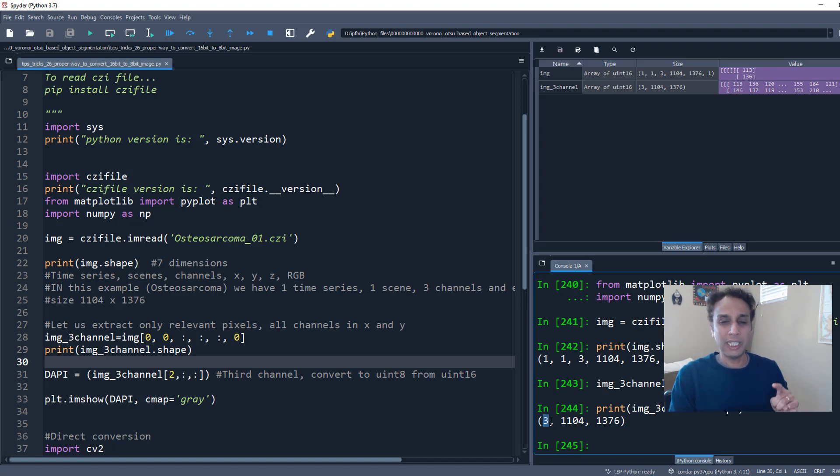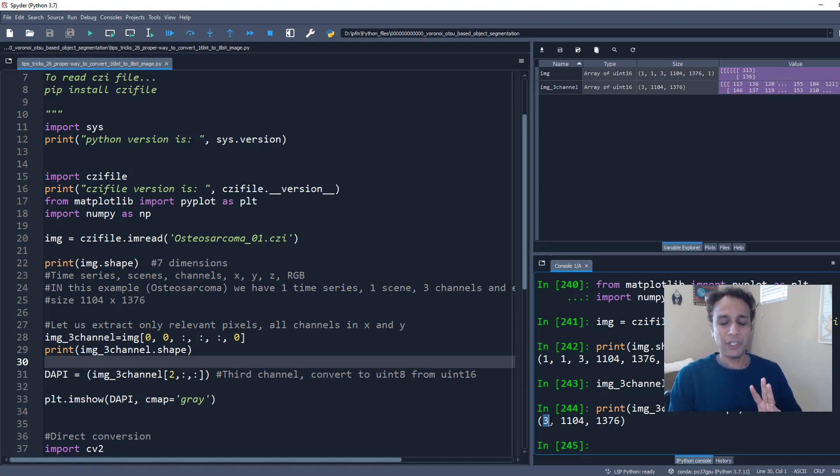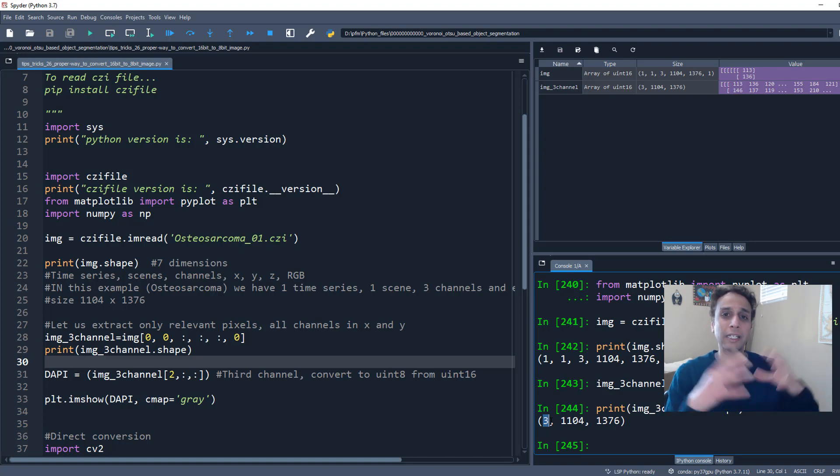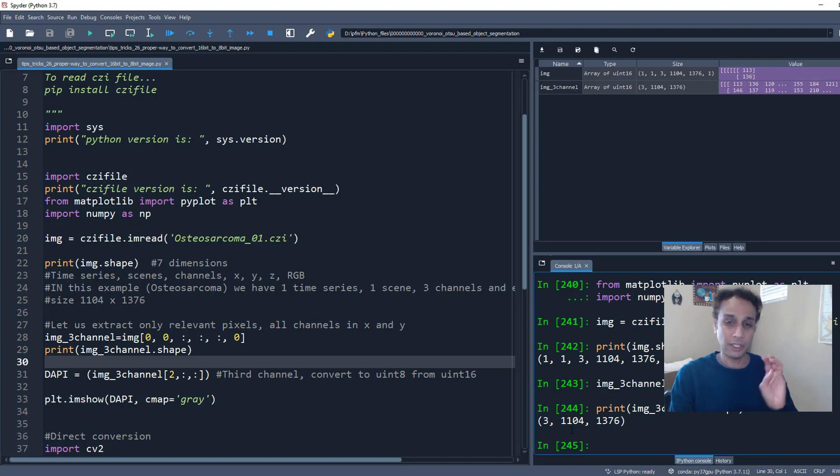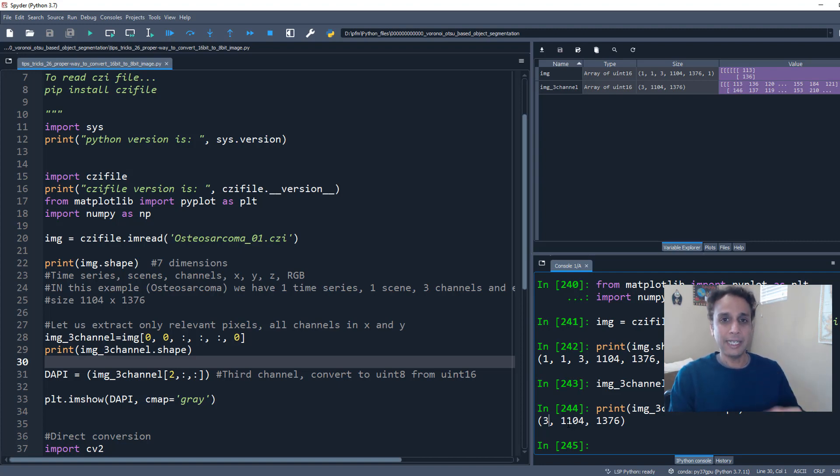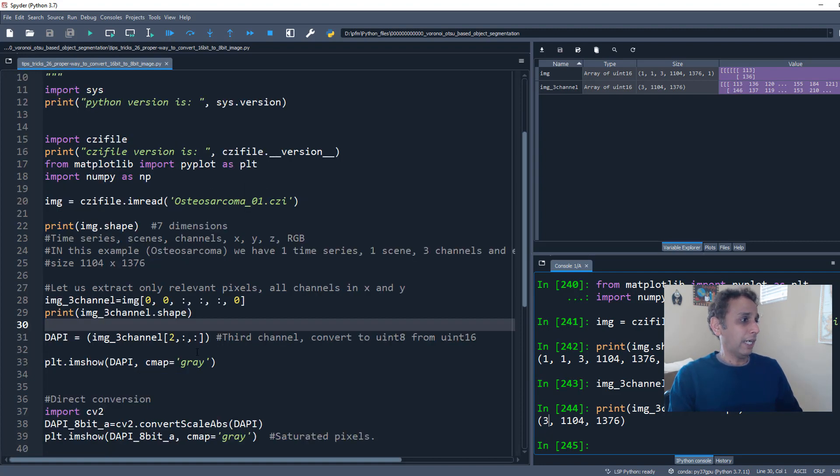I don't even need all three channels because these three channels represent three different unique features in this image. Like channel number one, I think, is... Anyway, these are three different channels. One of the channels is going to highlight the cytoplasm. The other channel is going to highlight the nucleus. And that's the one that I want in this case. And the channel that's highlighting the nucleus is the third one, which is stained with... Which represents the DAPI stained regions.